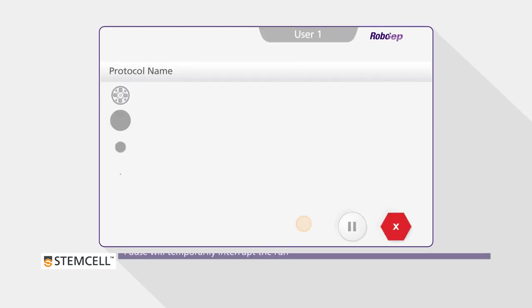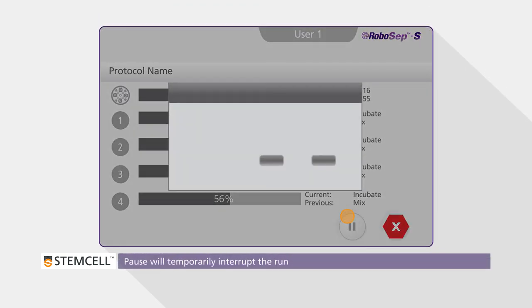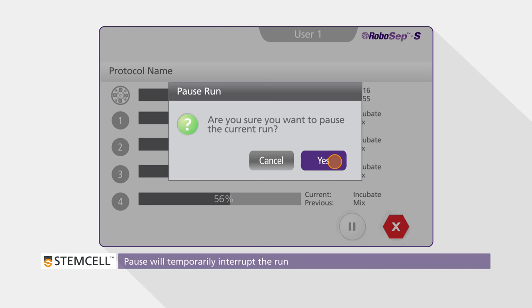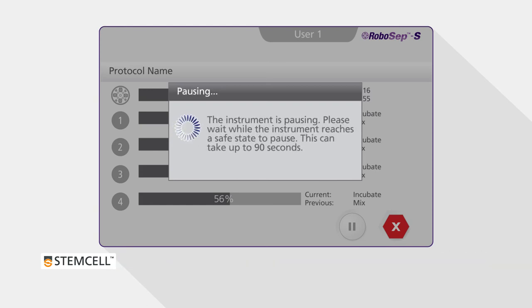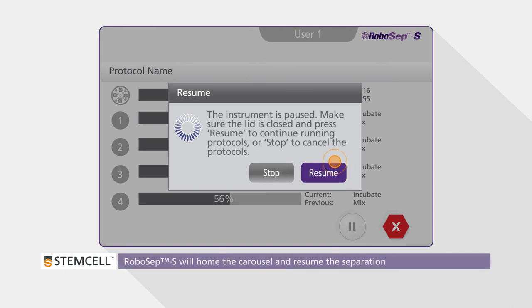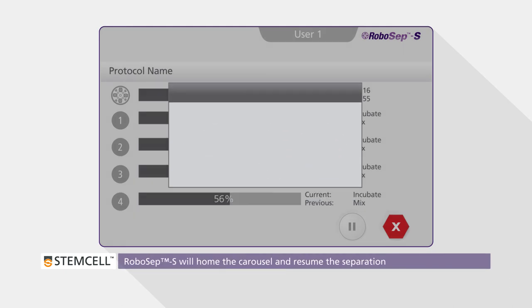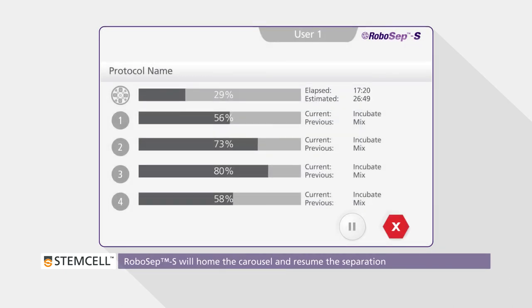If for some reason you need to pause the instrument, press the pause button. If you press the pause button, the run will be interrupted as soon as it completes the current action. To resume the run, press Resume. The RoboSep will re-home and continue the run at the next scheduled action.